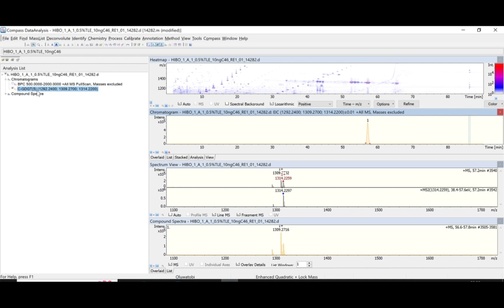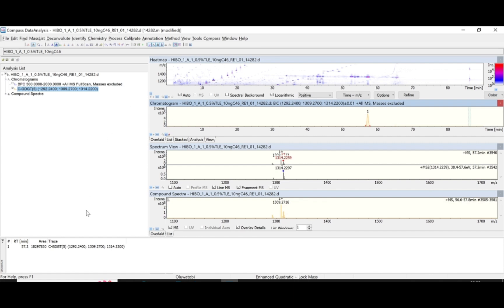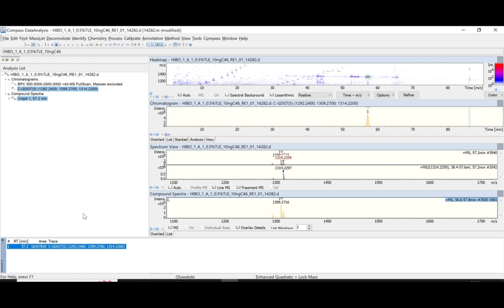Once you have done that, the next thing is to export your file into Excel for further processing or analysis. Click on Compound List, which gives you a list of all your compounds. Right-click and click Copy, then paste it into an Excel file. You can erase unnecessary data — you may not need the masses and just need the area, which is mostly the point of focus — and continue work to determine whatever you want to analyze with your data. Thank you for your time.